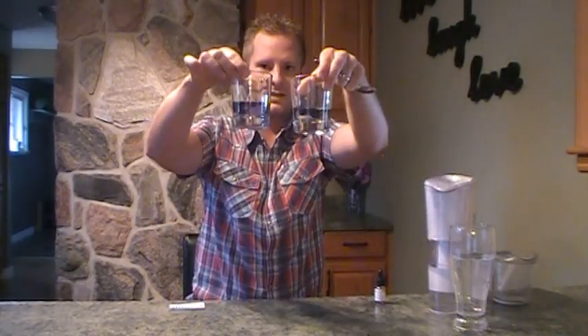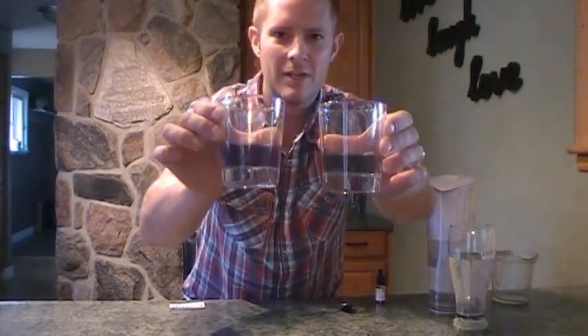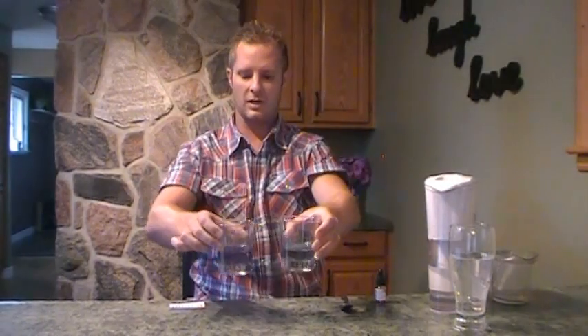I will bring these up closer to the camera so you can see them. As you can see already, without mixing, you can already see that there's a color difference there, but we're going to mix it up — do the tap water first, and then we do the alkaline water out of the Alka Pitcher. I'm going to bring those a little closer; hope you guys can see that — we definitely have a huge difference in color.